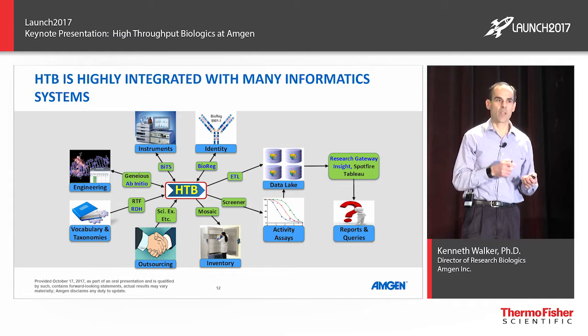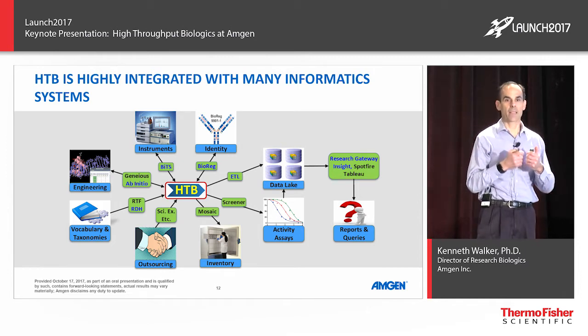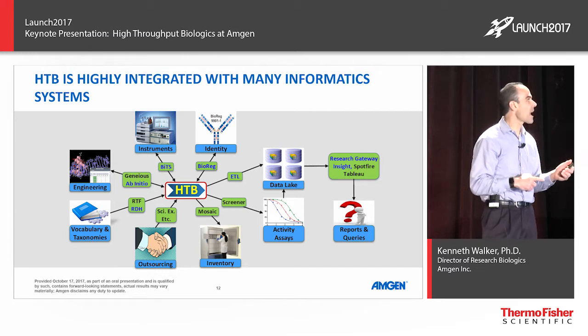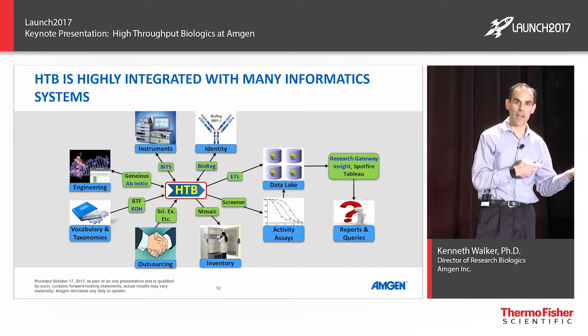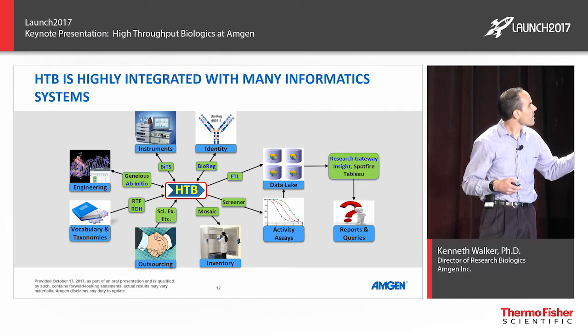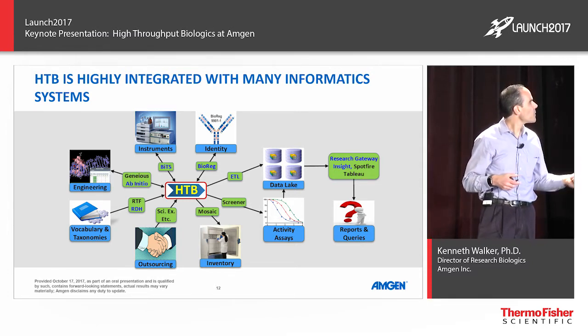So any type of atomic modifications that have actually occurred to these molecules change them. So for instance, a protein that has an identical sequence but maybe a different disulfide structure actually has a different identity than another molecule with the same amino acid sequence. So this gives us our very specific registration system for, and this here is basically the root number and the lot number for that particular molecule.